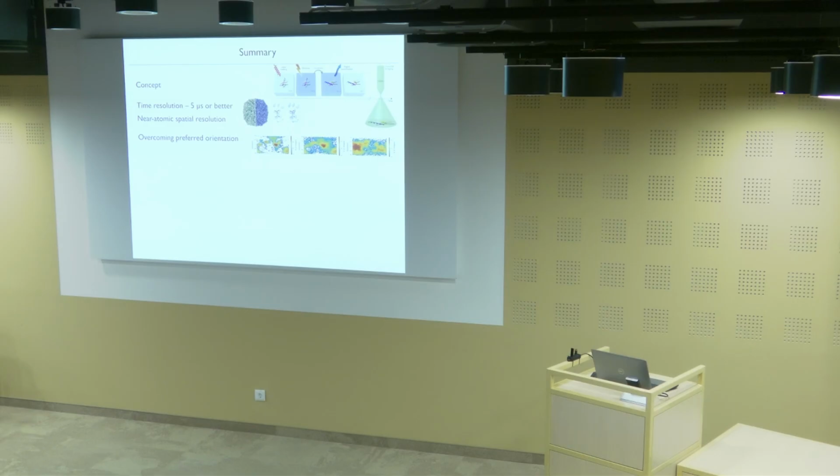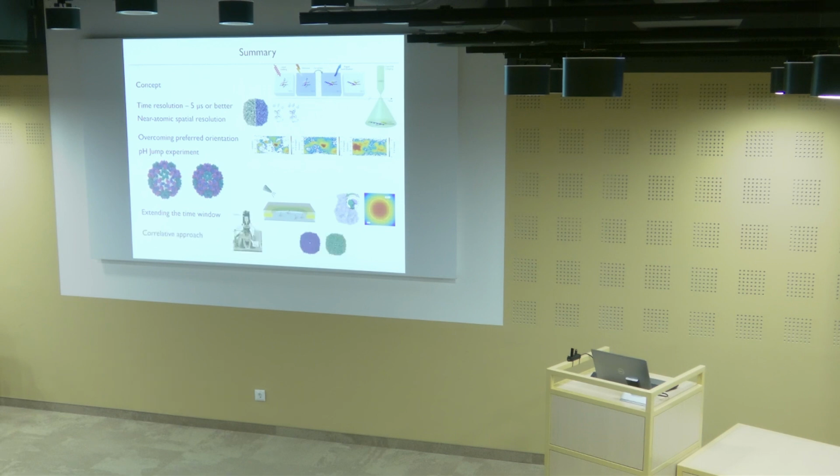I've shown you this pH jump experiment on this plant virus, and then also talked about how we can now access timescales of hundreds of microseconds. Really, we want to bridge the gap to the millisecond timescale where there's already traditional time-resolved cryo-EM. I haven't talked about this: there's essentially a trick to do these experiments in an optical microscope, which we think is an approach that should be more accessible to most people.